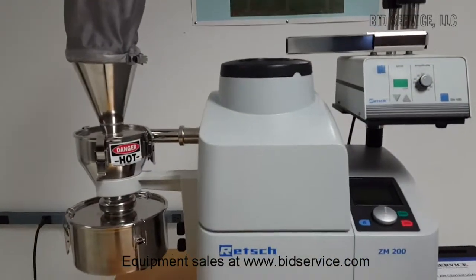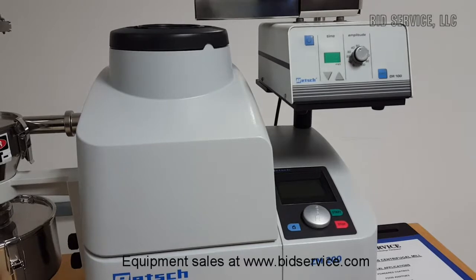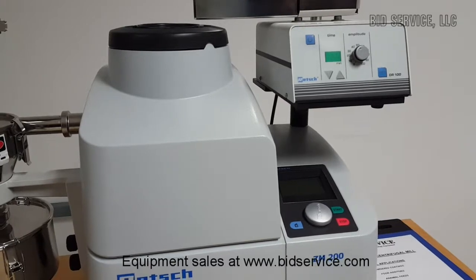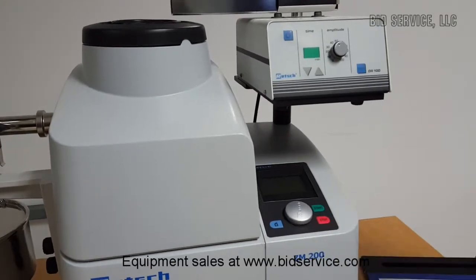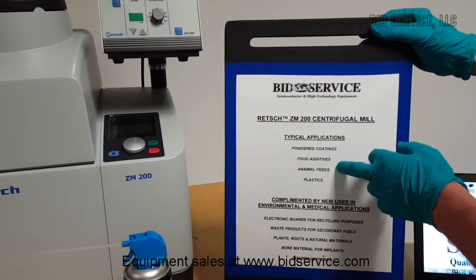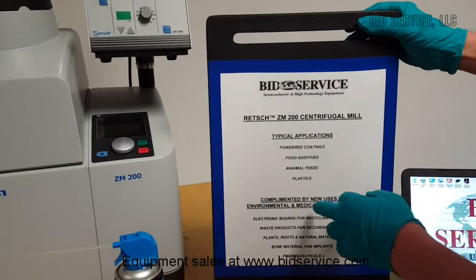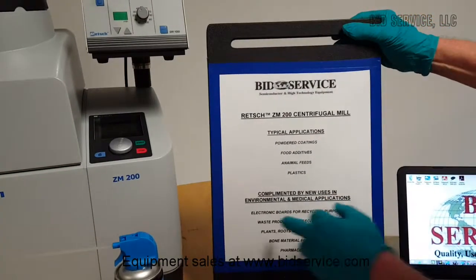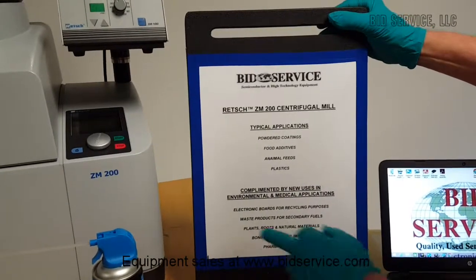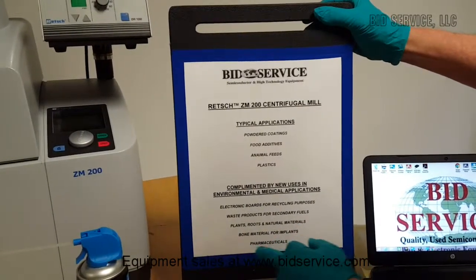Let me show you a few things before we turn it on. This mill has many applications. Typical applications are powdered coatings, food additives, animal feeds, and plastics, complemented by new uses in environmental and medical applications: electronic board recycling, waste products for secondary fuels, plants, roots, and natural materials, bone material for implants, and pharmaceuticals.